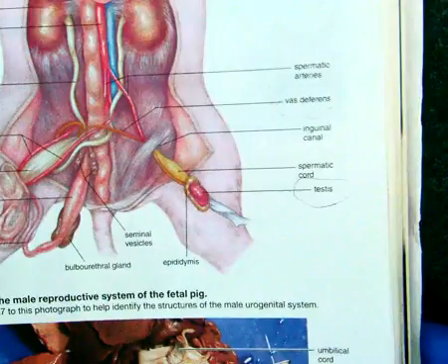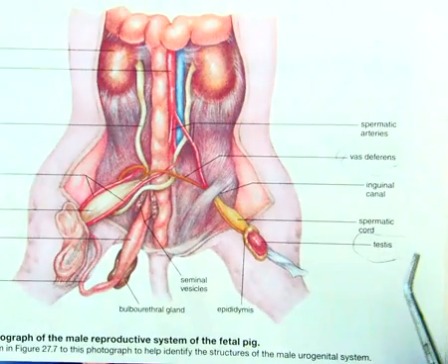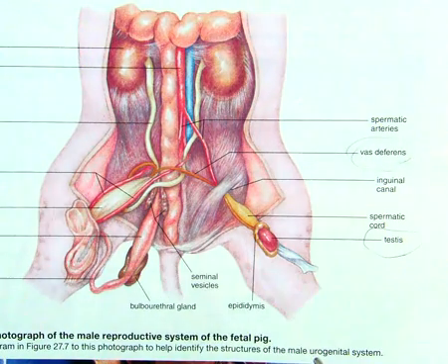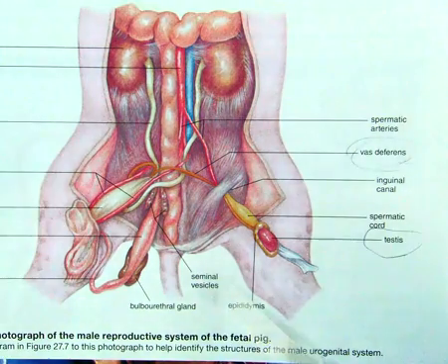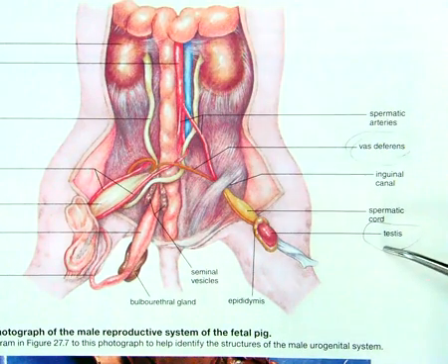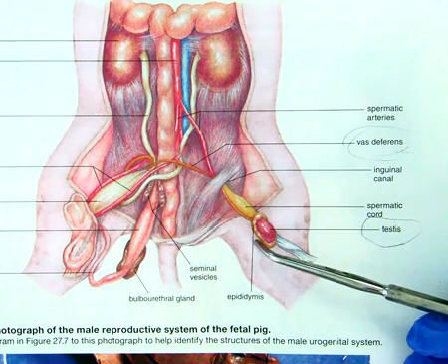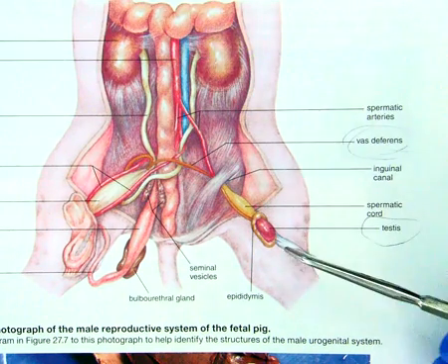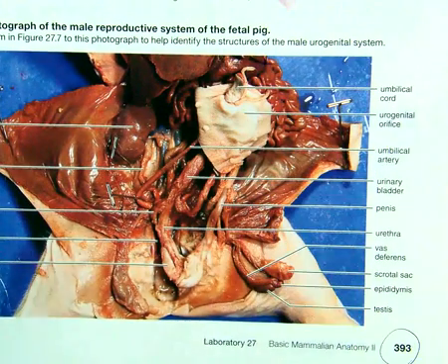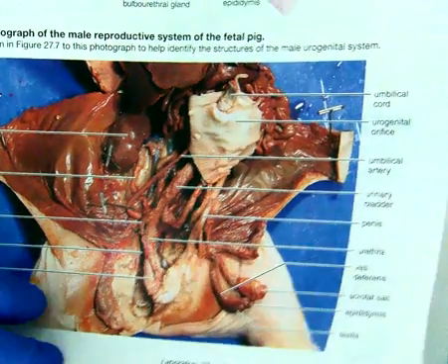Right, the male reproductive system, so they've expanded this image a little bit from male. We will easily find the vas deferens, and these are going to be looping behind the bladder, going into the body cavity, so we should be able to see those. The testes will be really easy to see. The epididymis is really easy. So we found these very nicely. The pigs are fairly large, so that should be evident to differentiate male and female. And it will look kind of like this at first, but I'll point out the parts to you guys on the real pigs, because we'll be looking at those.